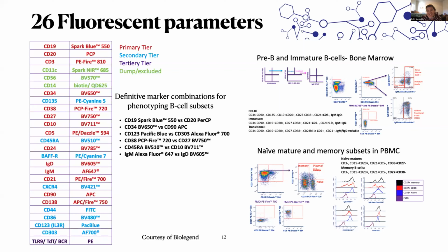And this is the age of flow cytometry that we're at. So 26 parameters, at the time that I did this a year ago, was the most parameters that had ever been done. And now, within maybe 3 months ago, a 40 parameter paper was just published using all of the brilliant violet dyes, all the brilliant horizon dyes, and then a bunch of new dyes that use DNA as a backbone.